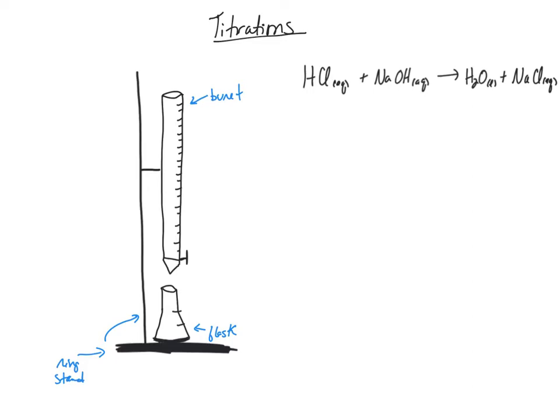So here's what a titration does. What we do is we start to fill this burette, and I'm going to give it a green color just because that keeps it different, up to almost the top. Usually the top. It doesn't have to be the top. Fine, if it's the top, then it's the top. And we put a certain amount of liquid down here in the flask.